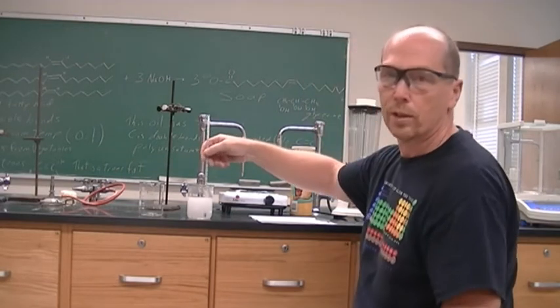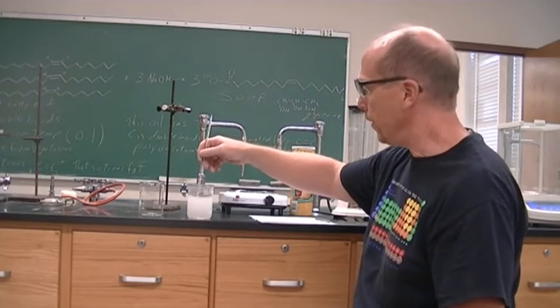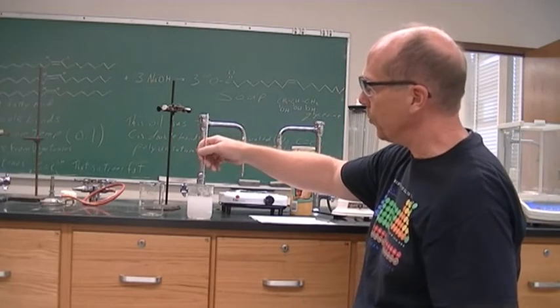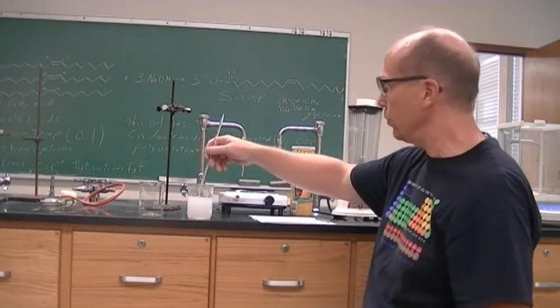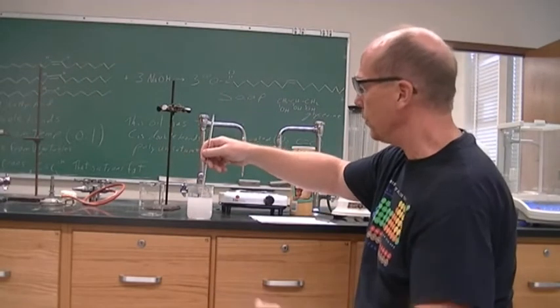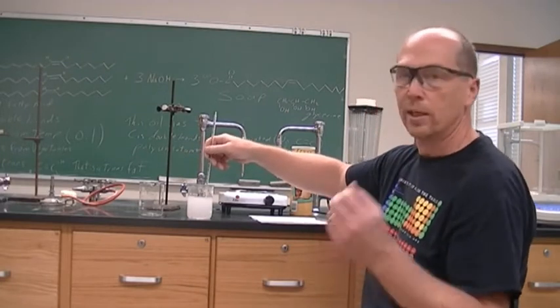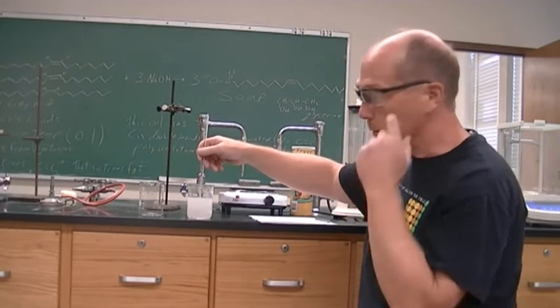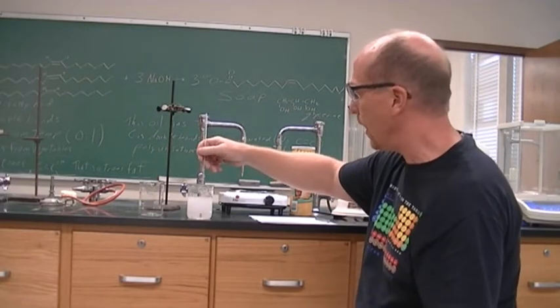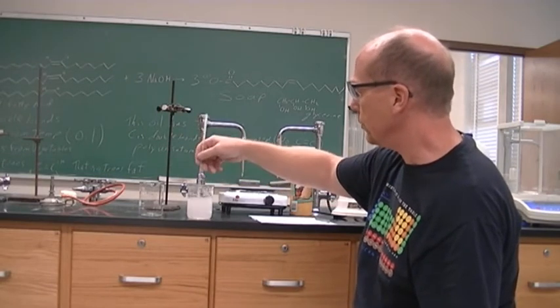The temperature is at 95.8. So it went up 70 degrees. Very hot. You can see the steam forming on here. This is a very exothermic process, and if you have ever used drain cleaner to clean a drain, it is very dangerous. It can boil out the water and shoot up in your face, and you have boiling sodium hydroxide in your face. So when you're doing your drain cleaning, you should also wear eye protection, and make sure you follow the directions carefully.